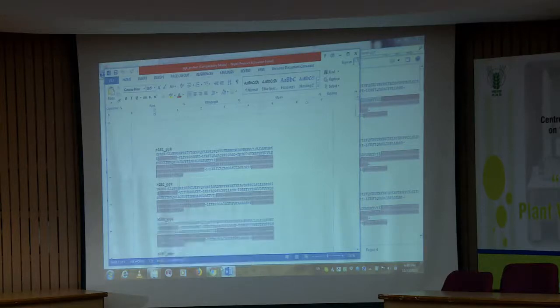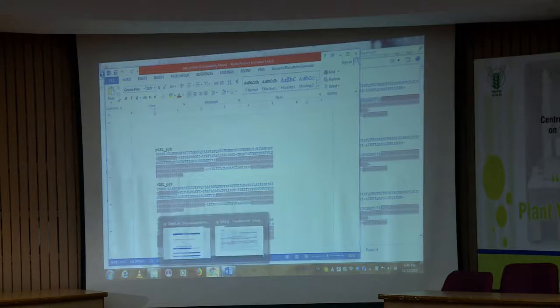At some places where the initial codon is there, M-methionine will be there. So, methionine, the whole word you have to replace with the code M, that it will specify while you will be editing it.